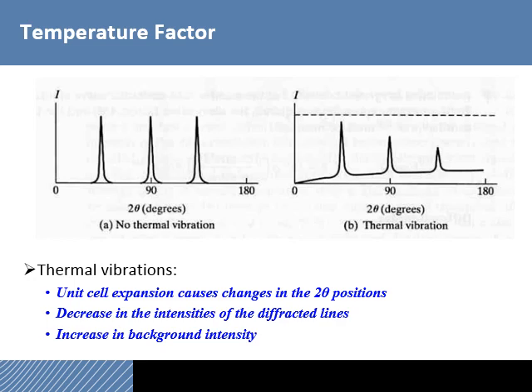For the most part, I don't think you need to worry too much about temperature factors. However, sometimes you may do a Rietveld refinement and find that the refinement doesn't work well for you. If you investigate how the structure was solved in the structure file that you brought in from the database, you may see that it was done at liquid nitrogen temperature, whereas you took your powder sample at room temperature. If the difference between the thermal vibrations at room temperature and liquid nitrogen temperature is substantial, it may actually impact your pattern, and you may want to consider refining the temperature factors.